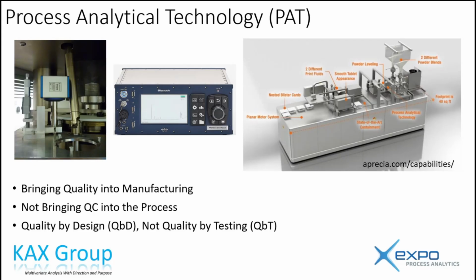But you've seen this application many times today over the last 2 days. Excellent application, mainly. And one thing that hasn't been brought up in terms of sampling, this is a 100% statistically representative sample that you're measuring, because it's the equivalent of a spinning riffler, which has got an RSD of less than 0.2%. That's why when we make measurements on the feed frame, they're representative of what the tablets are going to be. Therefore, we can put our diversion systems in and make good quality decisions.